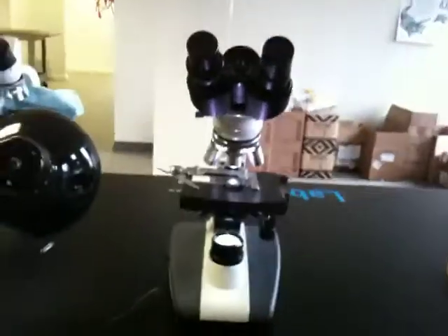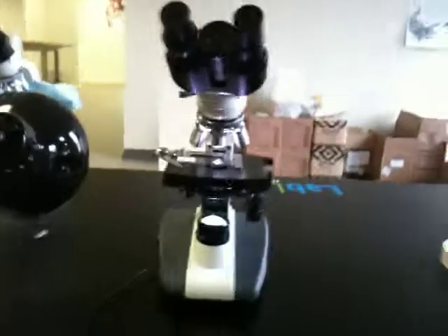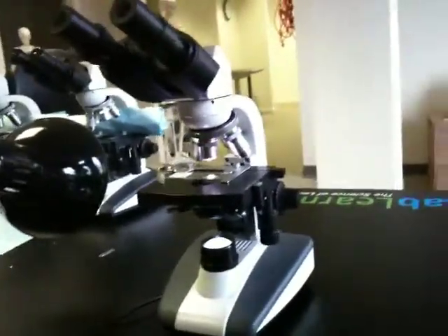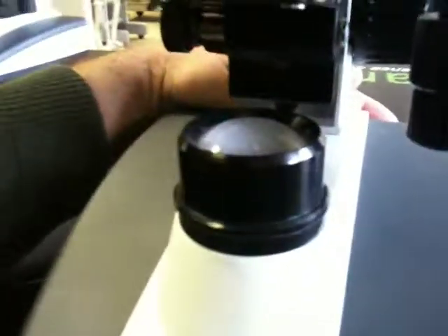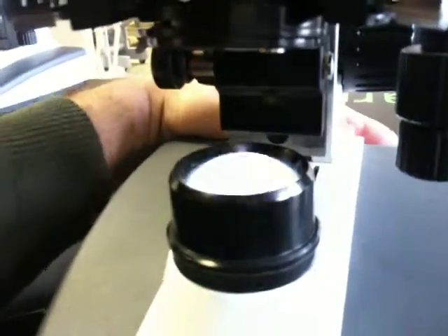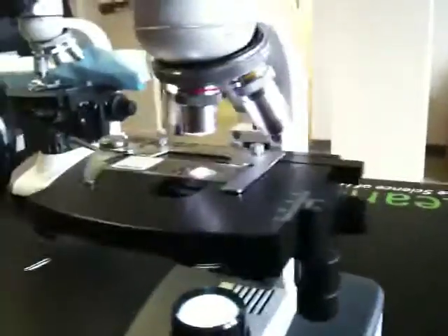We've had a few calls from the field related to these middle school microscopes of ours, and they're great microscopes. As you can see, I have the light turned on here. You can turn the light on and off in the back, and we went over that in professional development, and we learned how to focus and change the objectives and all that.